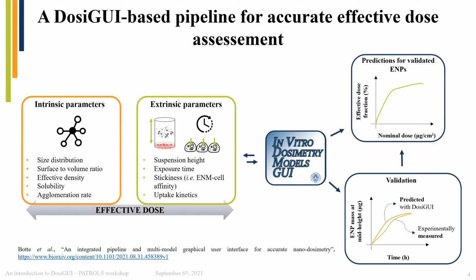If successfully validated for a specific nanoparticle, DosiGUI predictions can then be extended, as we can see in the figure, in the graph on the top right.